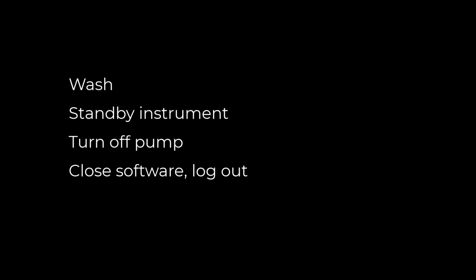When you are finished, run solvent through the solvent lines for 3 minutes, once with the injection valve in the load position and once with the injection valve in the inject position. This ensures that none of your sample is carried over into the data that the next user collects and also helps prevent the solvent lines from becoming clogged.